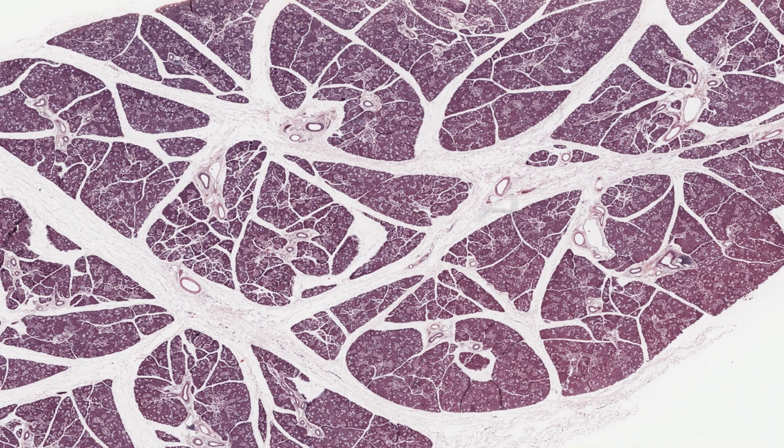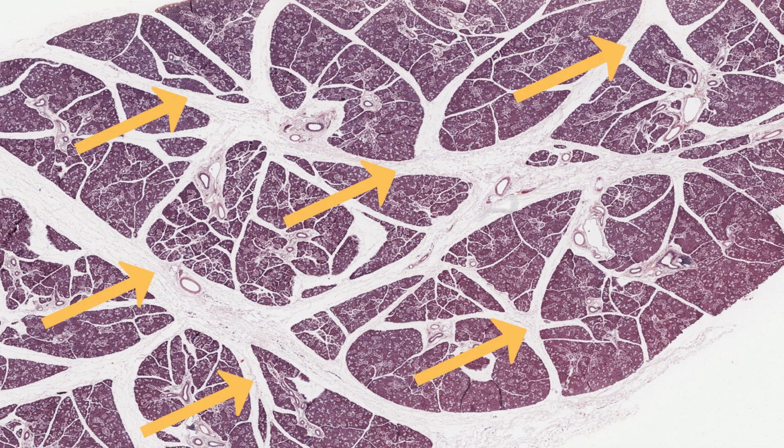The submandibular gland, or submaxillary gland, is a compound, branched, tubuloacinar mixed gland, and so has a substantial proportion of both mucus and serous secretory cells. The connective tissue septa, dividing the gland into lobules of various sizes, are obvious.